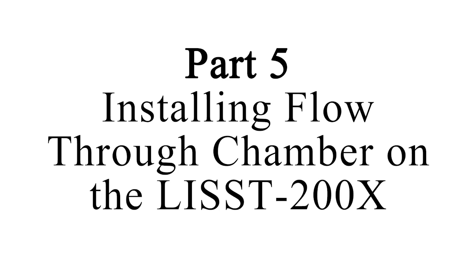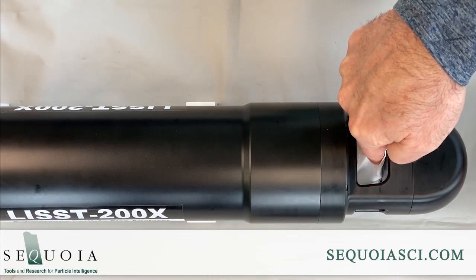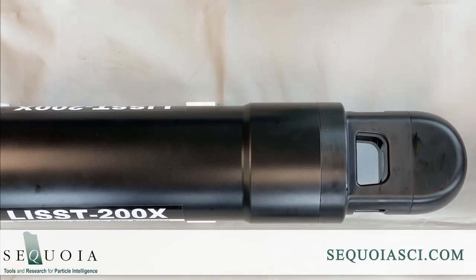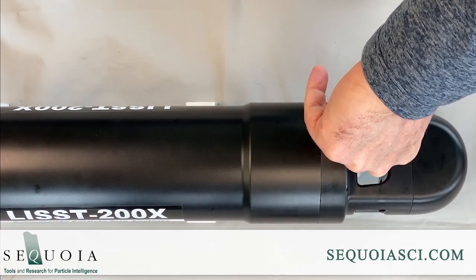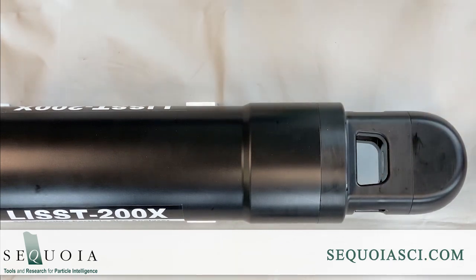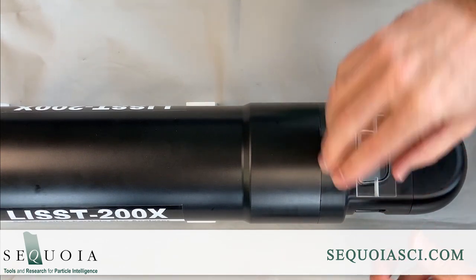The final step will be to install the LISST-200X flow-through chamber onto the optics end of the instrument. This chamber has 4 pieces that are inserted into the openings on the optics end of the LISST-200X. Disassemble the chamber by removing the 4 screws. Check that the O-rings on the 4 parts are installed and are clean. A very small amount of O-ring lubrication applied directly to the O-ring might be helpful.